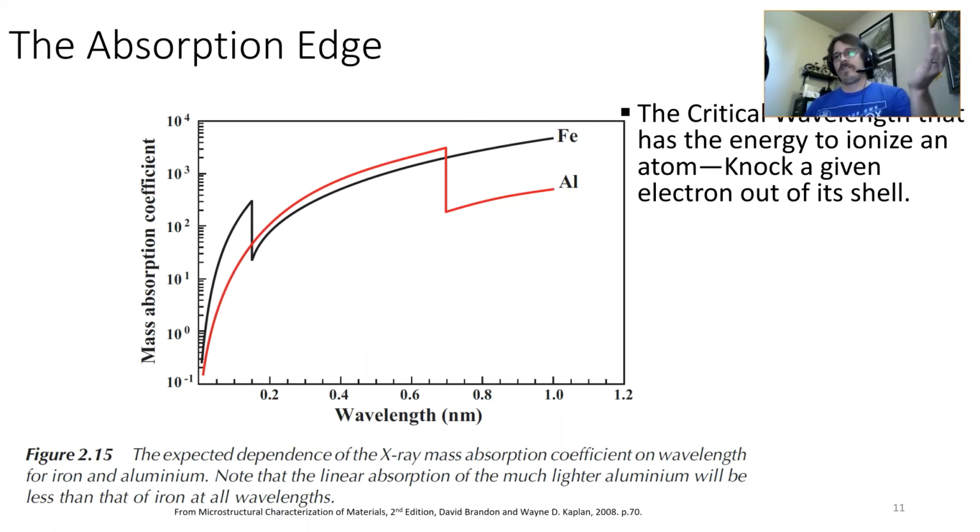Okay, and you saw on this NIST slide that absorption edges can occur for different specific radiations. I could probably figure out which one this is. I think this is K for iron and aluminum. But the absorption edge is very interesting when you're developing an X-ray diffraction system. If you remember, you want to have monochromatic X-rays to perform X-ray diffraction, because if you're performing diffraction with multiple wavelengths, you'll get a lot of peaks and it will be impossible to interpret your data. Okay, so you have to know what radiation you're using. And the absorption edge kind of works like this.